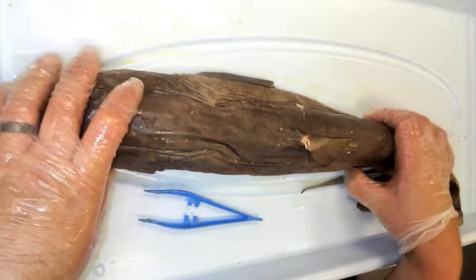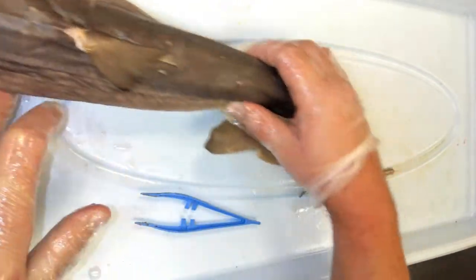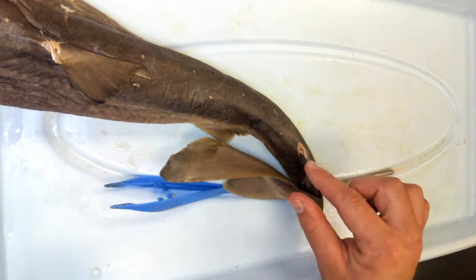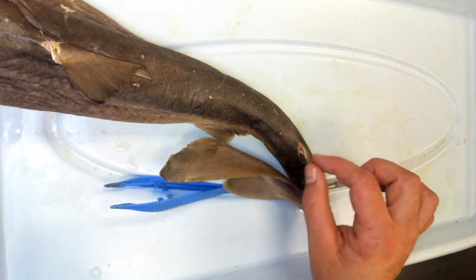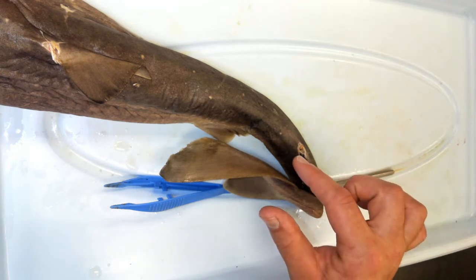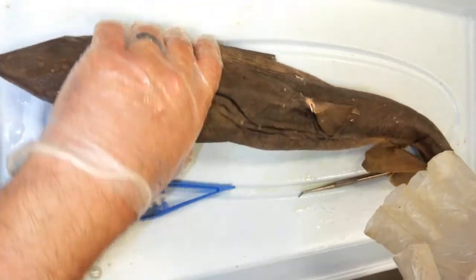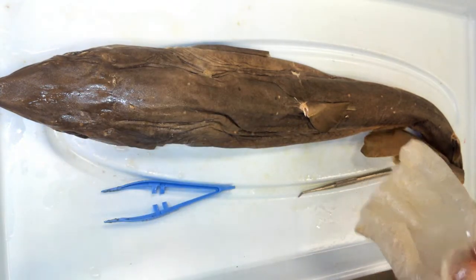This is the spiny dogfish shark. One last thing: anterior to each dorsal fin, we see notches where the venomous spines once were. These venomous spines pierce the shark's enemies and release a mild venom, so they are used for defensive purposes. In the next episode I am going to be cutting into it, dissecting it, and showing some important internal organs. Thank you.